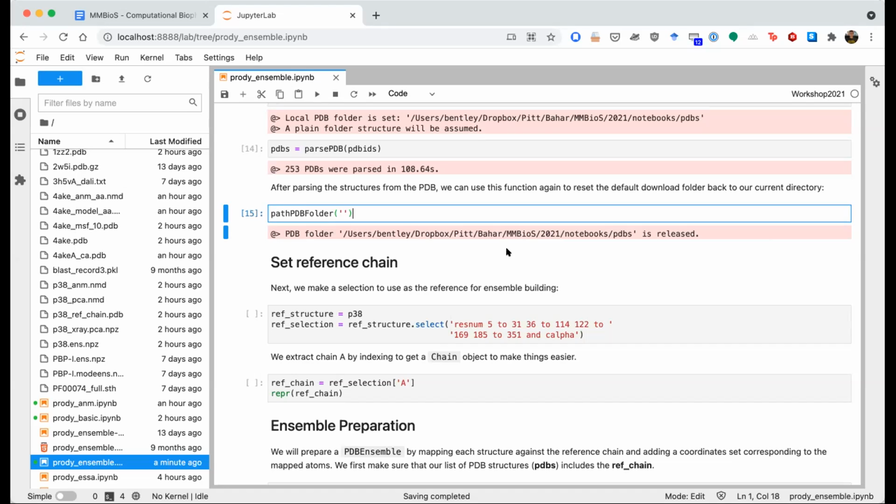But if you would like to, for example, project your experimental structures onto the space spanned by the PCs based on your DCD files, then you should not put your X-ray structures into that ensemble. Okay, so there are three ways you can do it. One way, you can generate the ensemble based on experimental structures, evaluate PCA, and then project your frames and also the X-ray structures onto the subspace defined by those PCs.